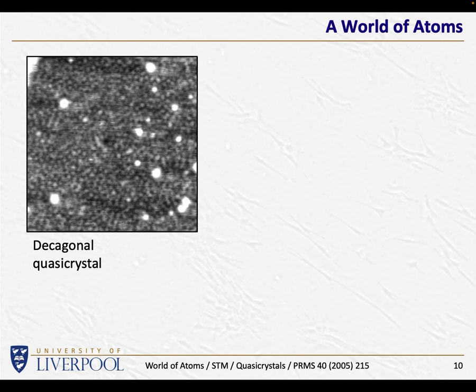And you probably can't see at all how the atoms are arranged in this particular image. It doesn't look like a very good quality image. And I always apologize in the sense that I'm deliberately using a low quality image to show you what image processing can do. Now, in this particular case, my colleague, Professor McGrath, actually produced much better images, but I'm still using this one as an example of what you can do. It's very difficult to see where the atoms are arranged in this particular crystal. But there are various things we can do.